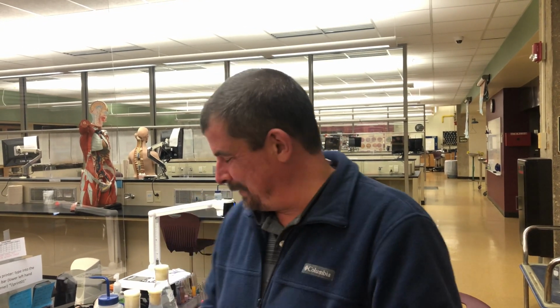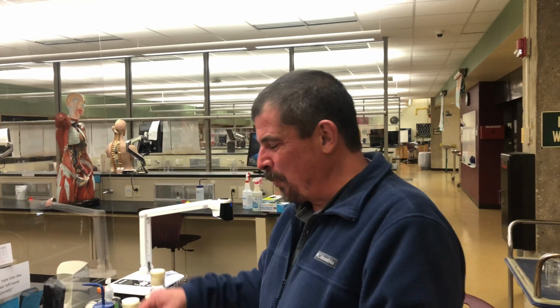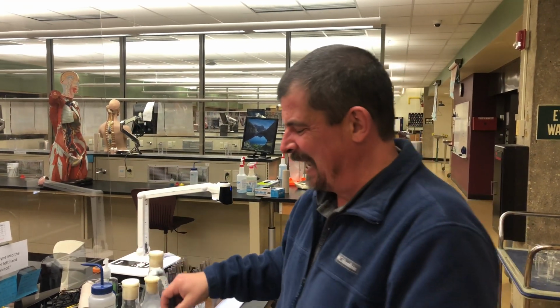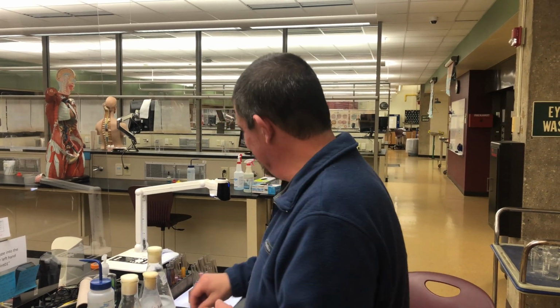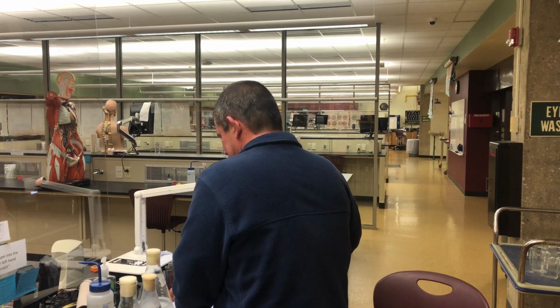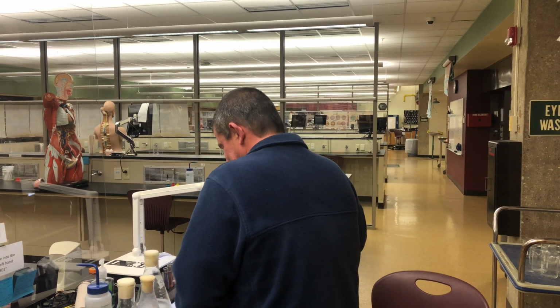Protein is present in both of the test tubes. That's why we would get at least one that would be purple, but we also hope that digestion occurred. Again, that's why we added the pancreatin with the enzymes. So we would add the Biuret's reagent to each of the test tubes, and then what ends up happening is this.